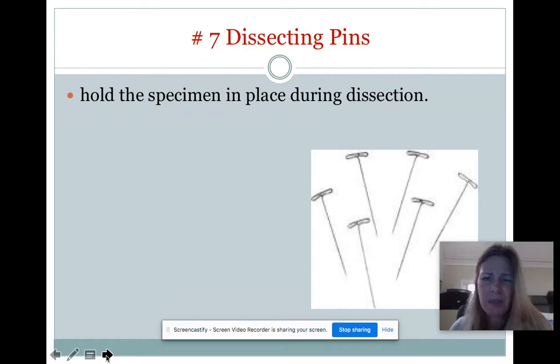These are dissecting pins. You will not be using those. And if you do see them, they'll be laid out on a dissecting pin and they'll be done by me. But again, they're used for anatomy when you want to hold open different tissue or even identification purposes when you're learning about arteries and veins and organs. There are often little tags with numbers on those. And you have to often, if you go into biology in college, identify those different organs, veins, and arteries. But again, we do most of those pieces virtually.